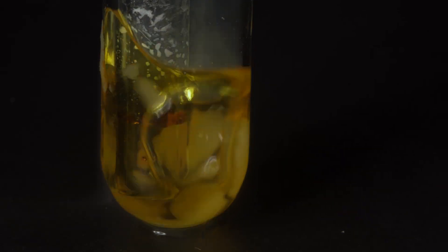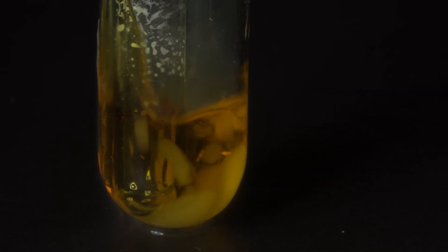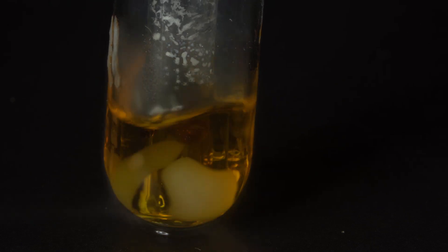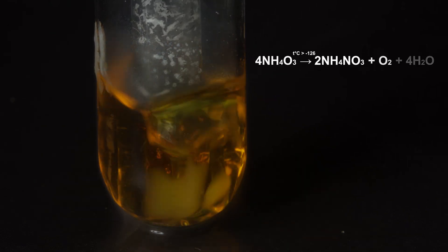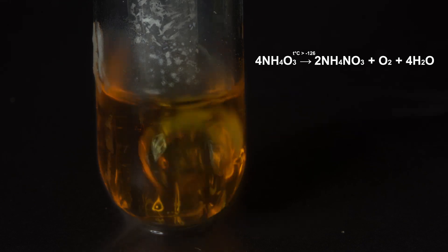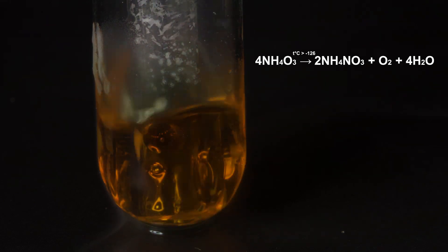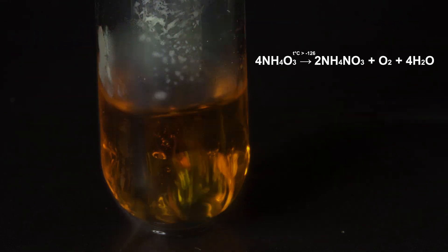Ammonium ozonide is a very unstable compound, and it decomposes at temperatures above minus 126 degrees Celsius into ammonium nitrate, oxygen and water, which enhances the decomposing process. You can see it right now due to a rapid discoloration.